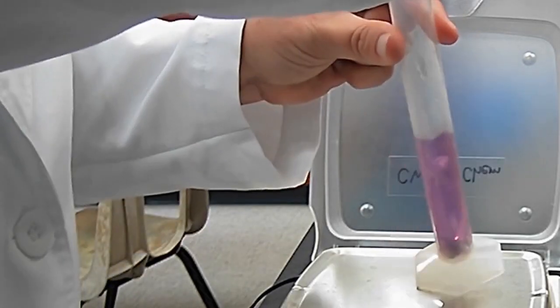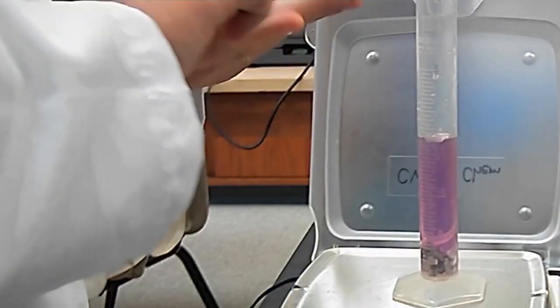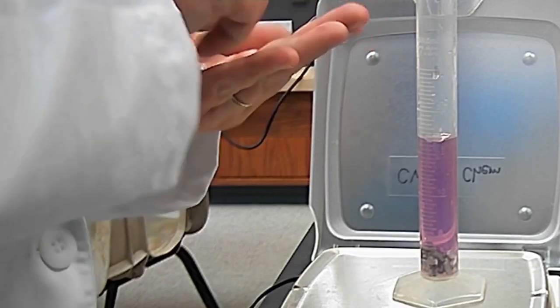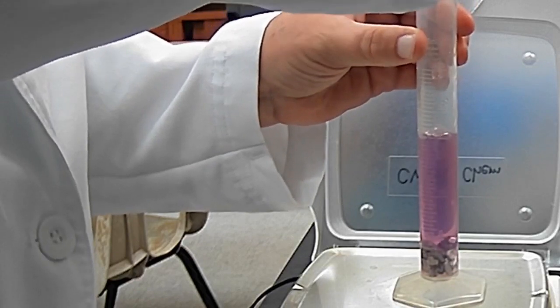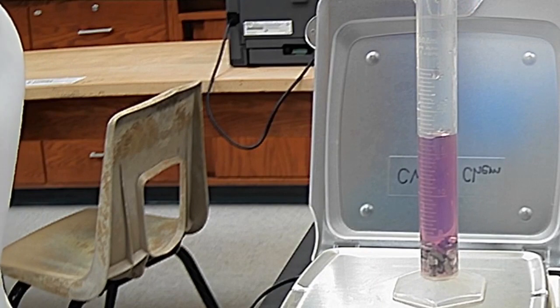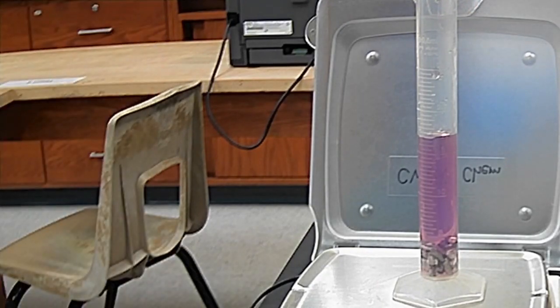Here we go. Let's add in. Still making a mess. Okay, mystery metal. So this is A. So our new mass is going to be 34.1. So our new mass is 34.1. Okay, this is trial 3 for metal A. Our new mass is 34.1.